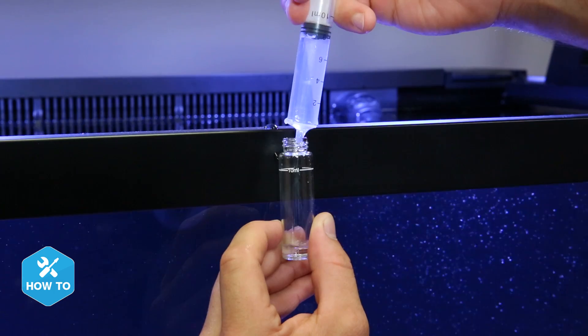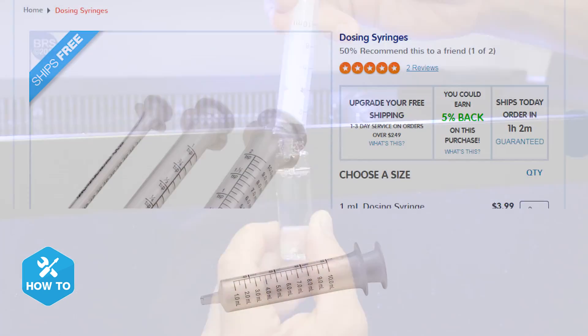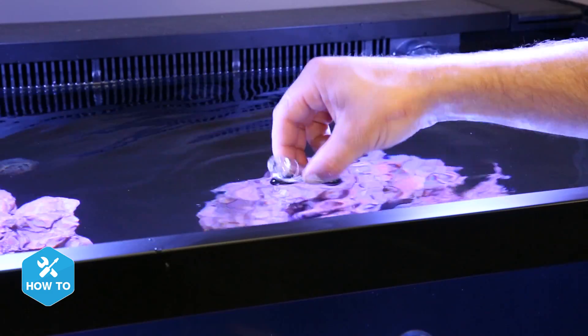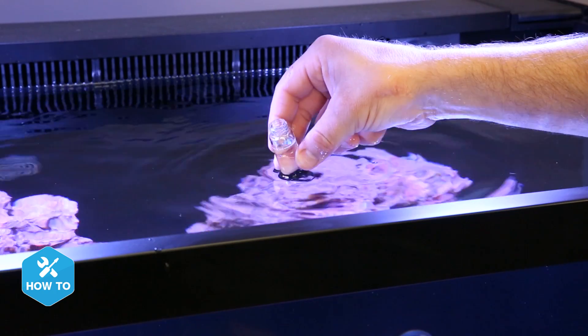So let's put one to use. To get started, I'll gather a sample of my tank water until it's level with the 10 mil mark on the vial. I find that these very inexpensive 10 mil syringes make it much easier to fill the sample rather than trying to dip it in the water, and it also keeps the outside of the cuvette clean, which is very important for accurate testing.